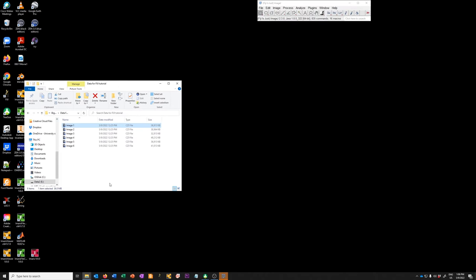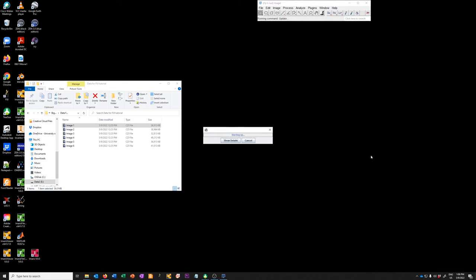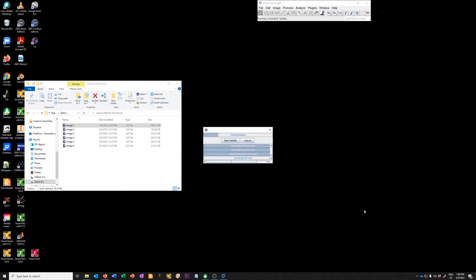Fiji has started up. One important thing: if you want to update Fiji, go to Help and click Update. It will show you something like this where it checks various sites with different components that are part of Fiji. You can see the details of what it's checking, and if there are updates available it will let you apply them. Let's go through one cycle of this just so you can see what it looks like.